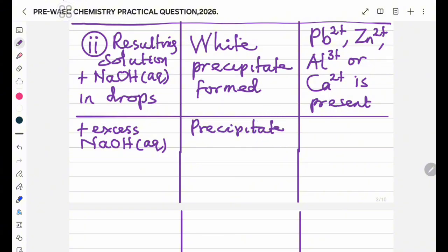When a precipitate dissolves, it must give a solution. Like I told you, if a white solid dissolves in a solvent, either water or the aqueous reagent solution we are using, the white substance will dissolve to form a colorless solution.